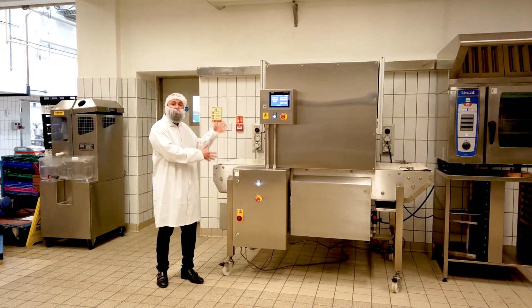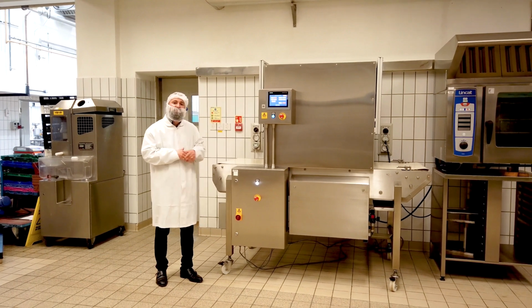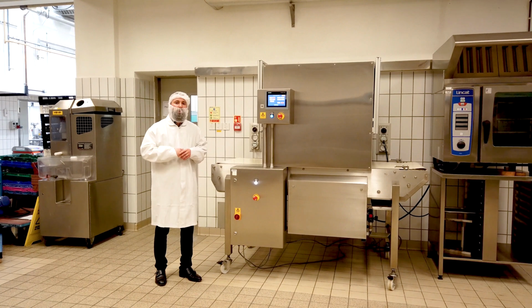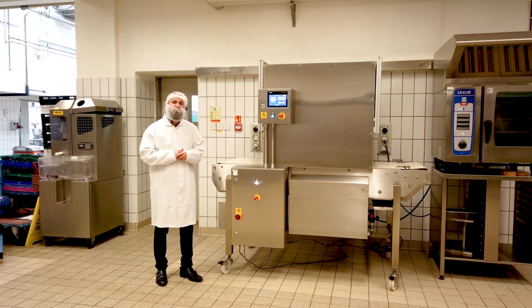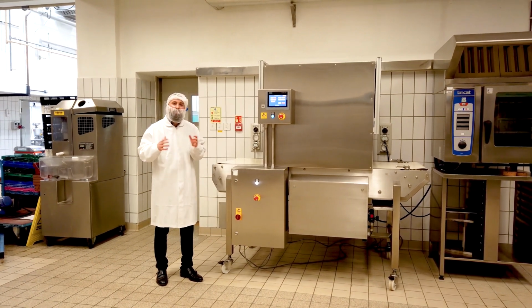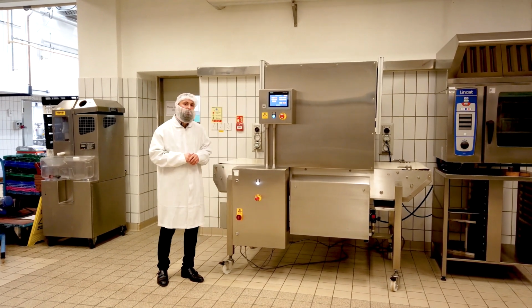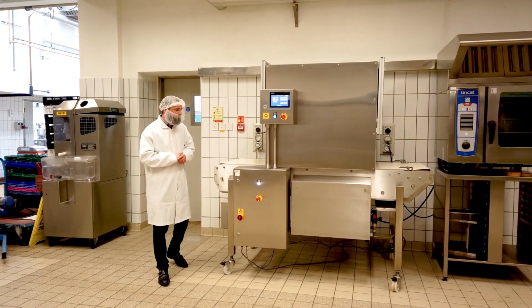We've been using this prototype system to understand the inactivation on continuous conveyor belts. We've been working with the University of Liverpool in trying to find applications for cold atmospheric plasma. This is because at the moment it's not commercially there, but there are still some applications that are starting to emerge. So how do we generate plasma?